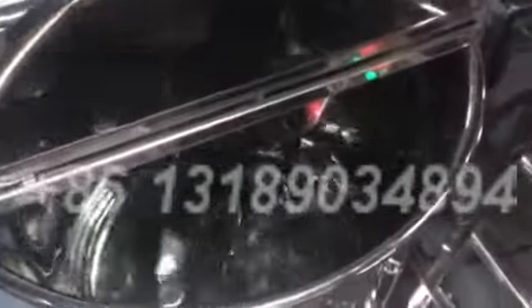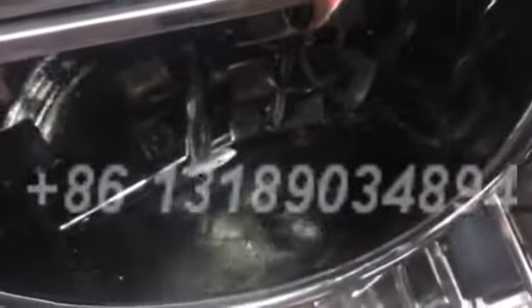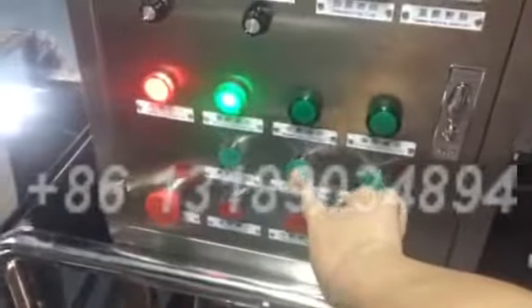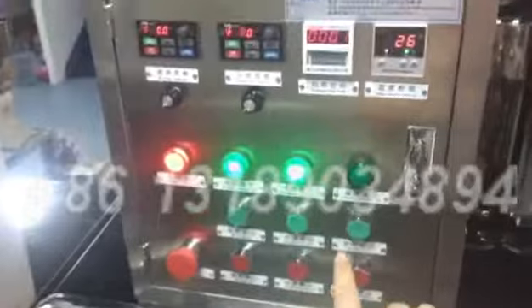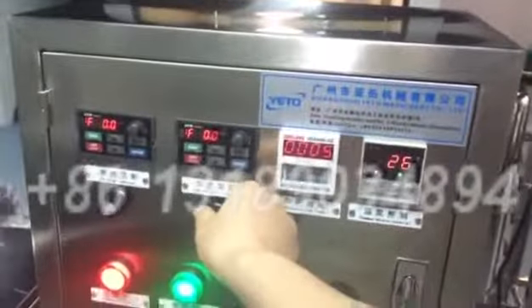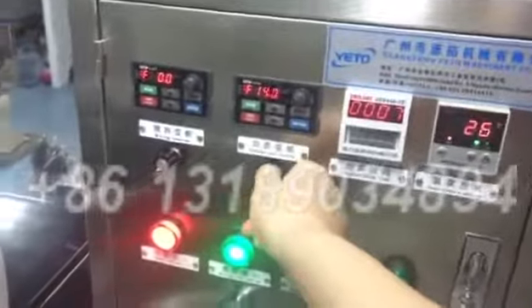Now we open the homogenizer. Wait, I will show you the speed of the homogenizer.